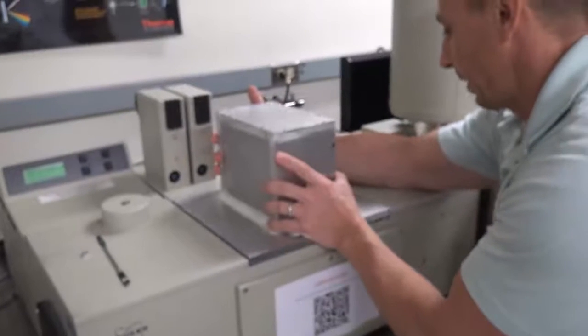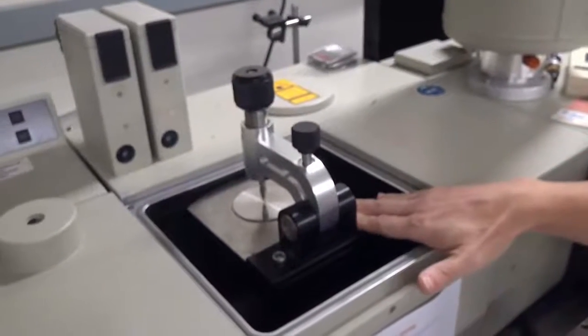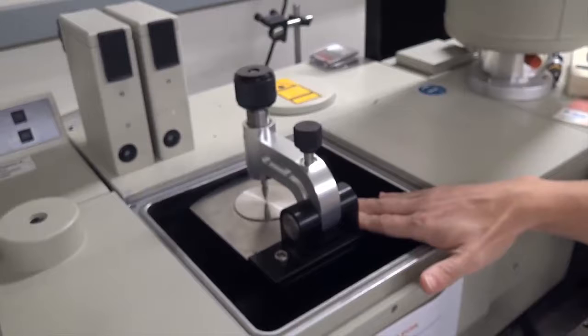After the system is vented, you can carefully lift the silver lid straight up and set it on the table. Be careful not to hit the arm under the lid because the lid is pretty heavy. Now that the lid is off, we can see the Diamond ATR.